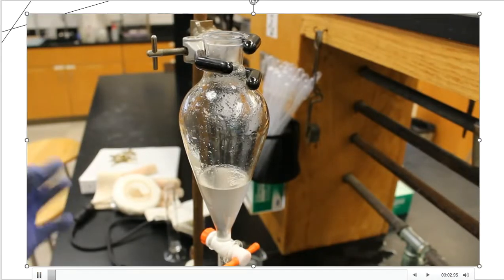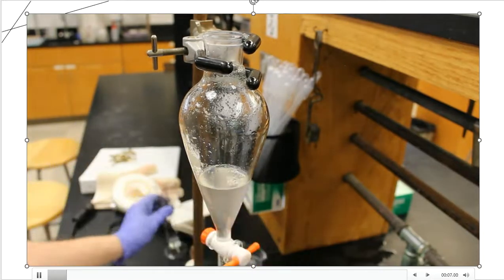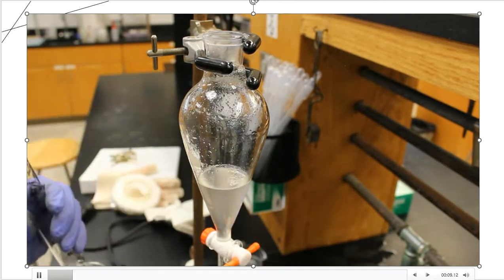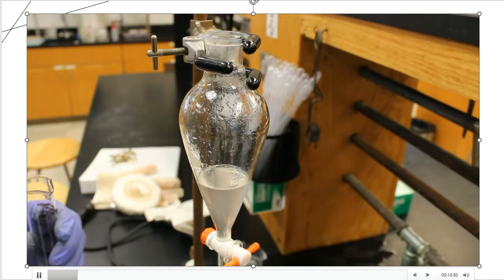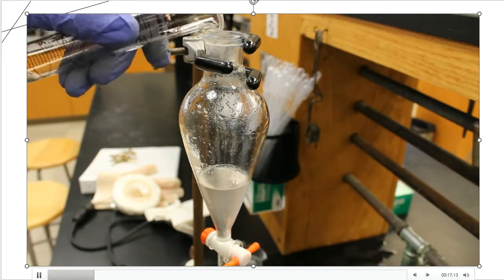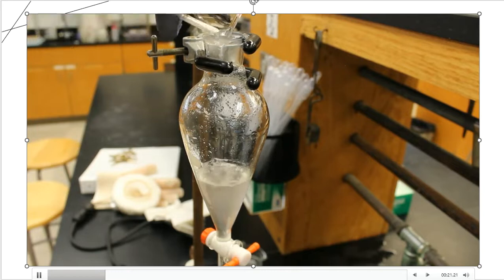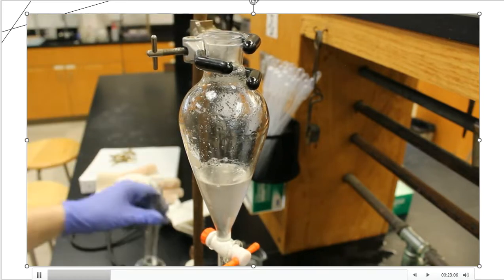All right, so in the next step, I'm going to add the methylene chloride back in, and I did, and it tells me to add a 3 molar solution of sodium hydroxide. Sodium hydroxide is a base. It's going to help neutralize and do a pretty important step that you'll find out about in the pre-lab lectures if you've done that, and I'm going to slowly add the sodium hydroxide in.